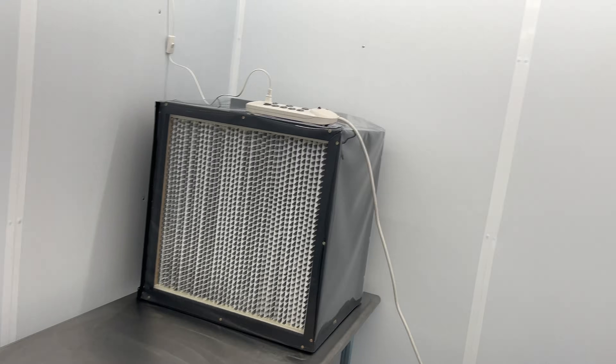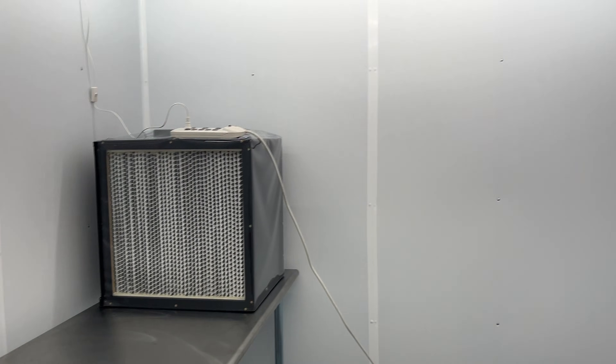Just moved the flow hood in, got the lights all rigged up — it's nice and bright in here. Now I'm just going to hook up the flow hood to the ventilation system and we'll be good to go.